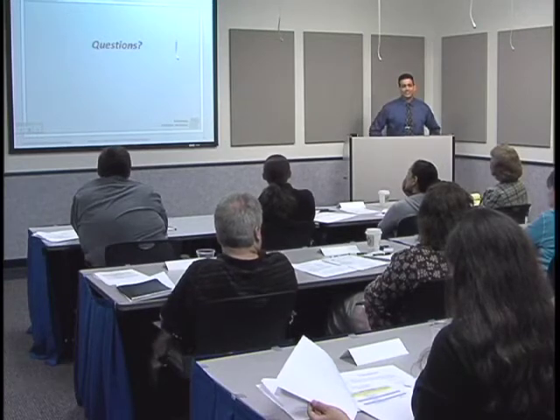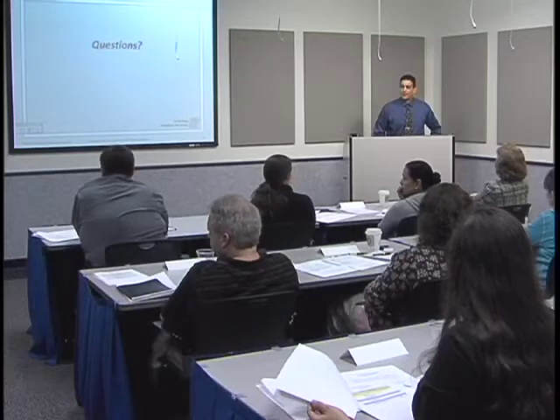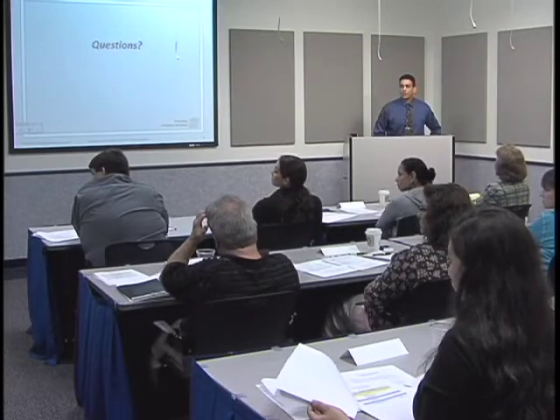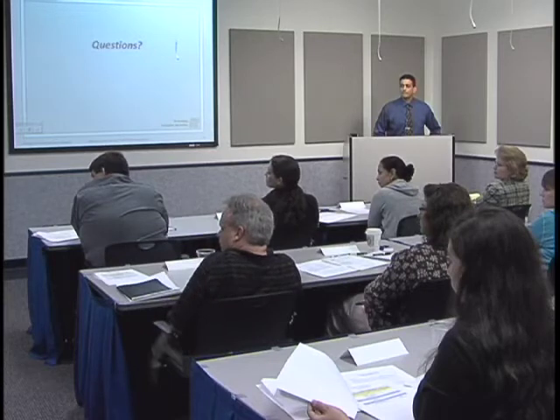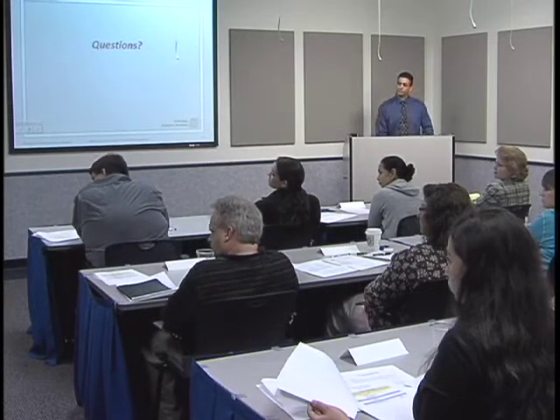Okay, any questions on anything? Yes? If the QIAcube decides to stop working or something occurs during the process, is that then indicated robotically so the analyst can clearly know what step it stopped at, so then the analyst could pick it up manually? I believe the QIAcube, yes, it will give you a warning. There's a log file. Every run is saved to a USB stick that's on the system, and the error code in the log file indicates where the issue occurred, and so you could take it out and finish it manually, for instance. Did you have to do that at all?